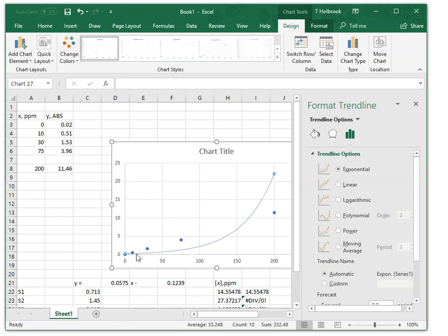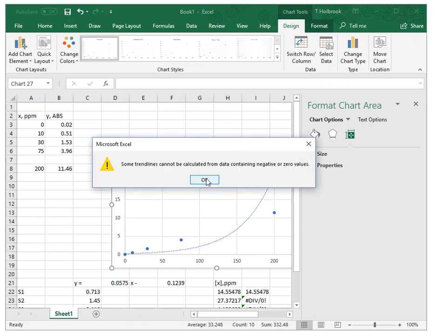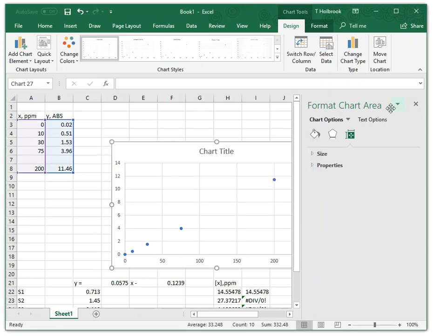So we know that this is not an exponential regression curve, right? Here's the logarithmic curve, and notice the exponential starts here at 0, 0, and it goes up exponentially. The logarithmic curve does something a little bit different. And here I'm going to get an error, because it says you can't have the point 0. 0 is going to cause a problem with the logarithmic curve, so it's not going to show up. But if it did, it would start closer to the 0, 0 mark, there would be some curvature in the very beginning, like it was going to go up, up, up, and then it would just kind of flatline after that. So some of the data that we have in the lab could be due to logarithmic data relationships instead of linear or exponential.